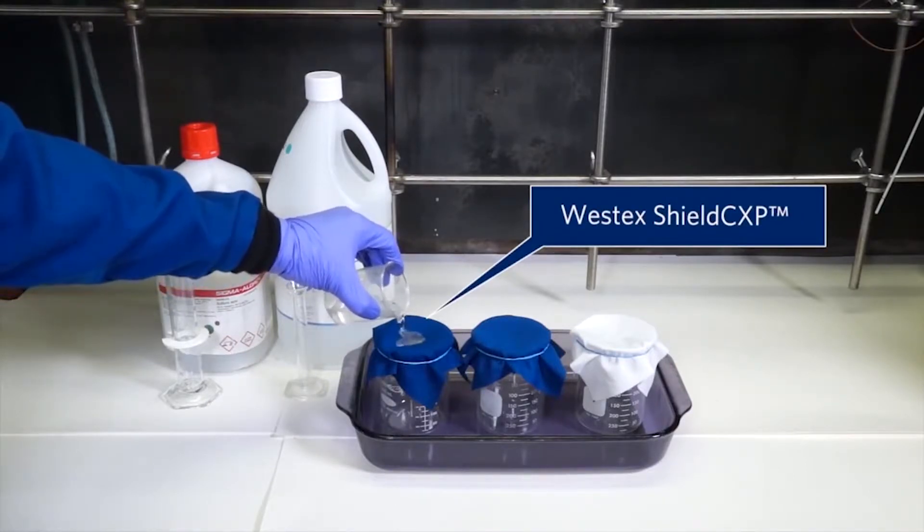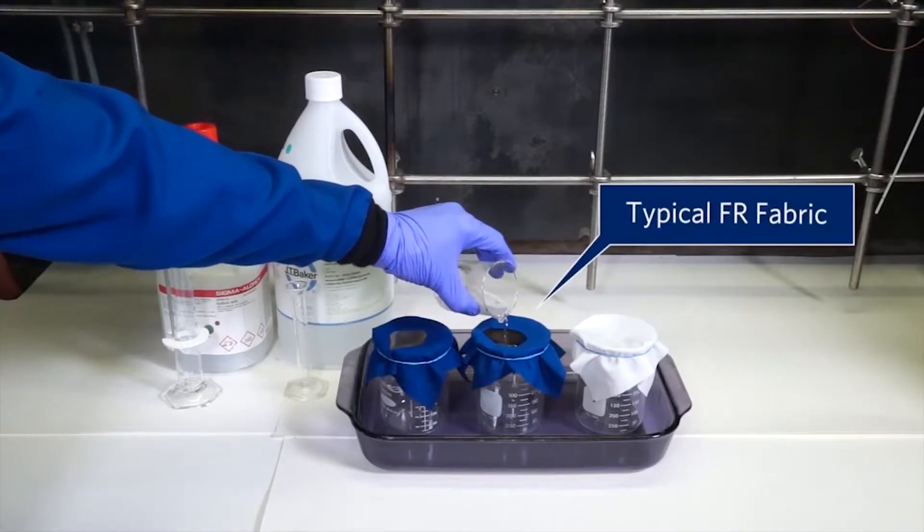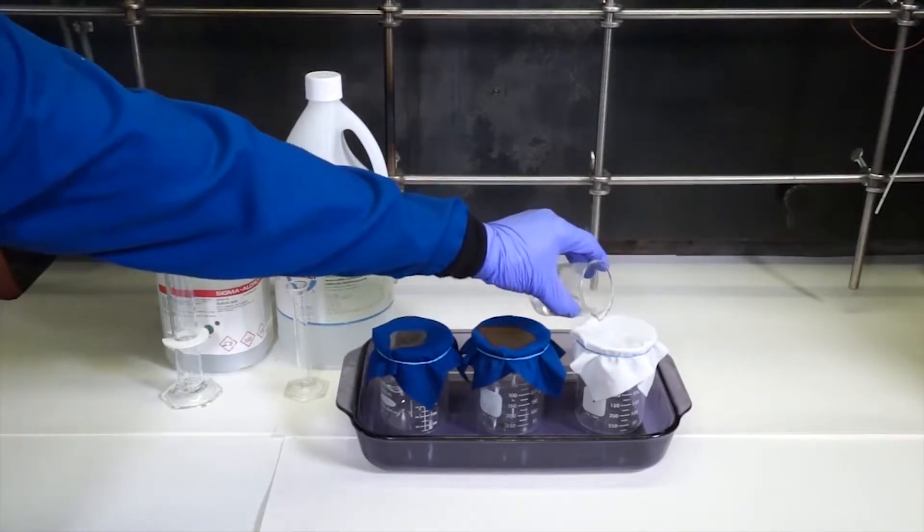See how this commonly used solution of sulfuric acid and hydrogen peroxide pools on the surface of Shield CXP while it quickly eats through a FR lab coat fabric.